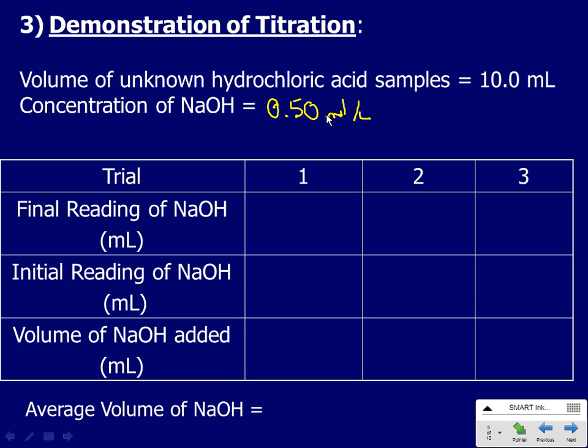If you have extra acid left, especially on the second day, actually I'll get you to do the same even on the first day, save it. Because in the end, we actually clean the burette with some acid. The sodium hydroxide gets sticky in there. So I leave that little bit in the tip, and I've got 2. You'll have water in your little water container.